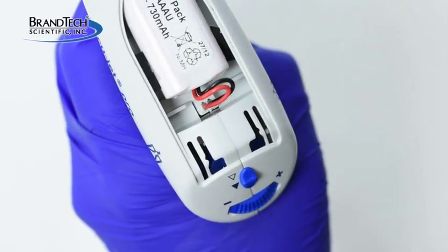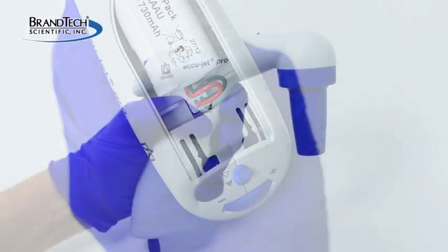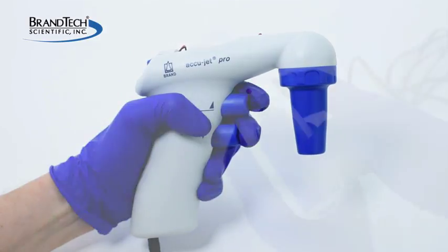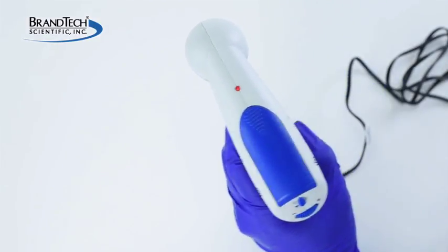Once the charger and the battery are reconnected, the buttons can be released. Now reinstall the battery cover and charge the instrument as usual.